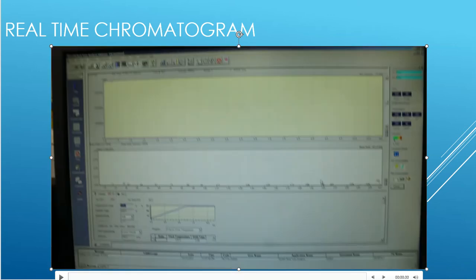All right, so a little bit of intro about the software, the GC portion, the MS portion. Again, we're only focused on the MS portion, and that is it. But it gives you kind of a general overview of the mystery that happens behind the injection and how we obtain the MS. A lot of people ask us, well, what does the program actually use the MS for?